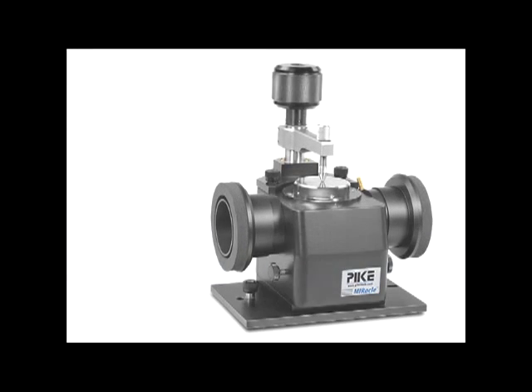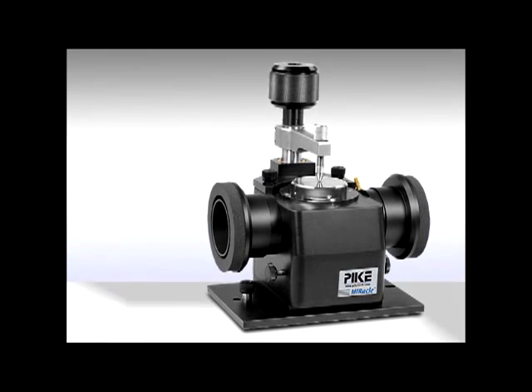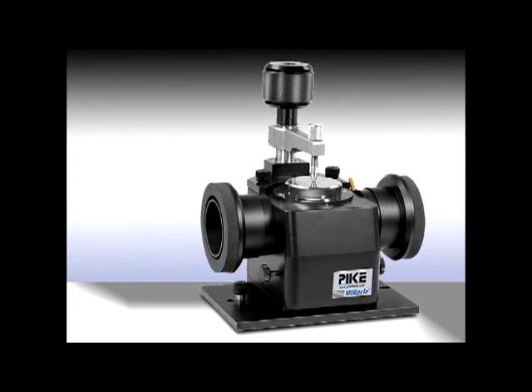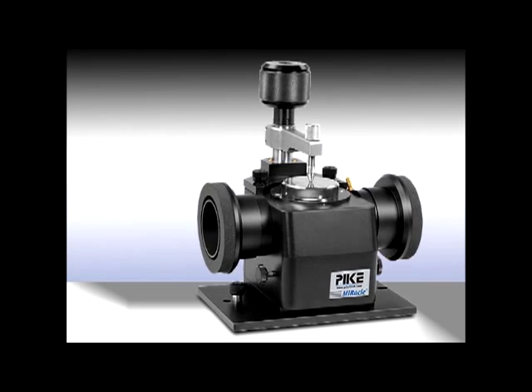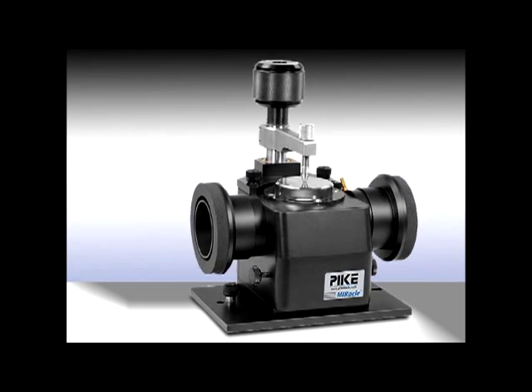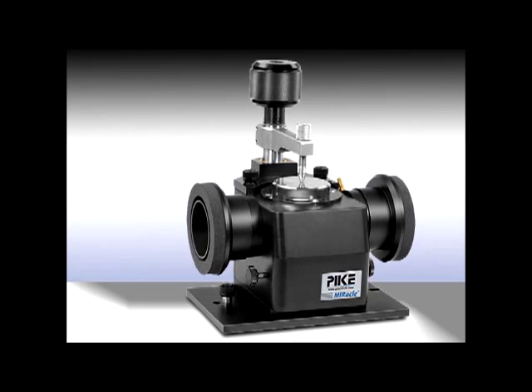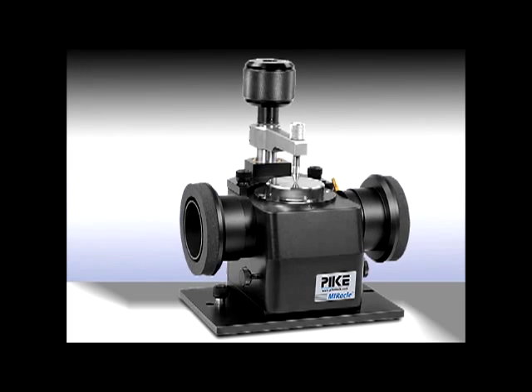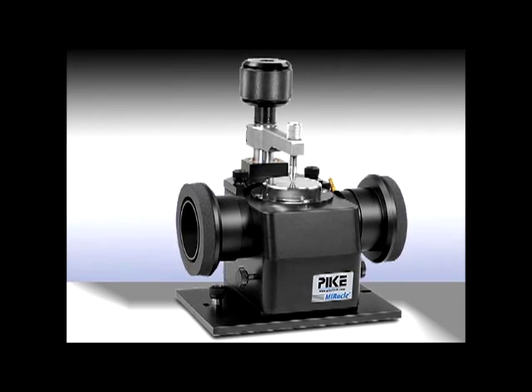Pike Technologies is a leader in spectroscopic sampling accessories. The MIRacle, a cornerstone of our portfolio, is known for its performance, versatility, and configurability.